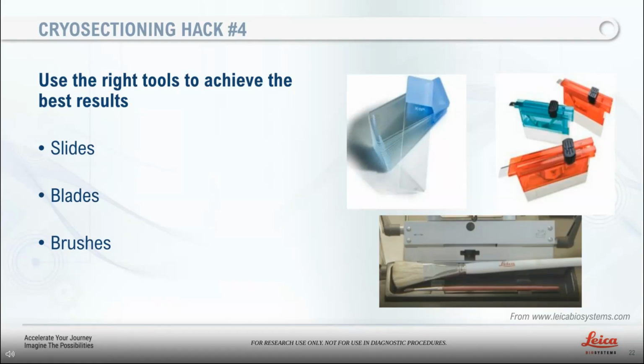You will also need to use brushes to help while collecting your sections and to keep your working area clean. Soft brushes should be used at all times, and one should try to avoid touching the sections with the brush. Brushes can also help prevent the sections from rolling while transferring to the slide.